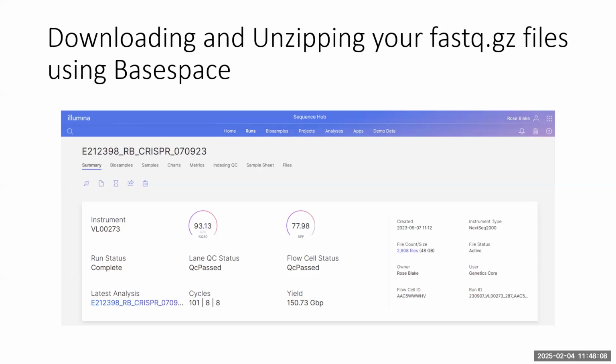That's a good question. I think we allow 1 to 2 mismatches, depending on the quality of the sequence. So Nick, when he runs this, or now the postdocs, in the script, I think you can change those variables. And if you run it and pretty much everything matches to your library, maybe 10% or something like that, you're kind of like, just leave it. If you're getting low levels of matching, then that's kind of a worry.